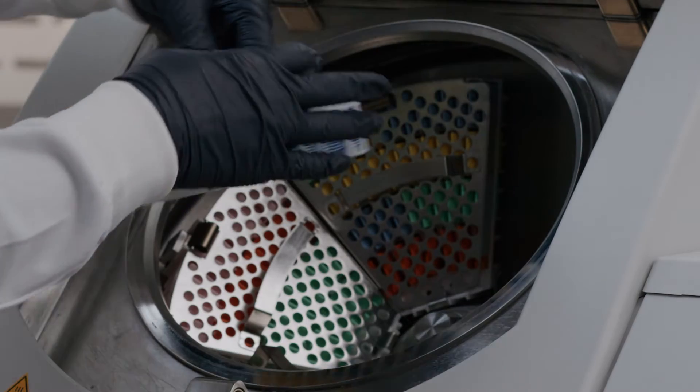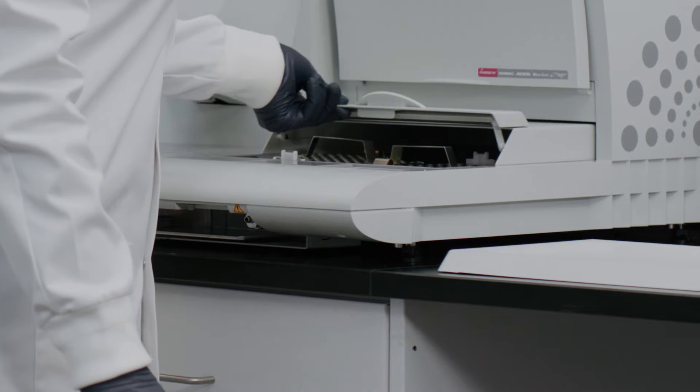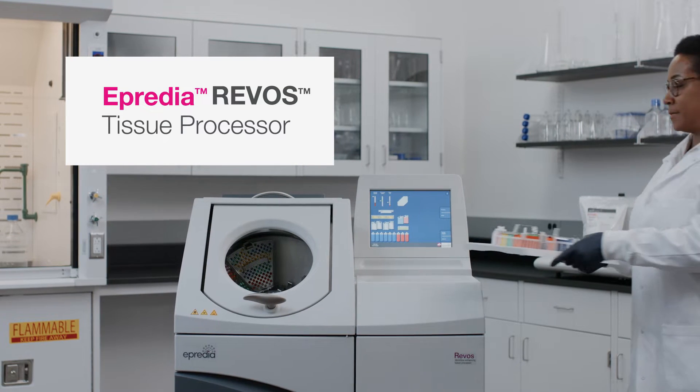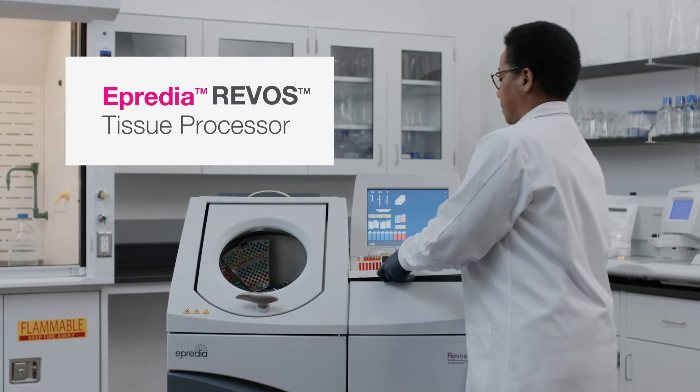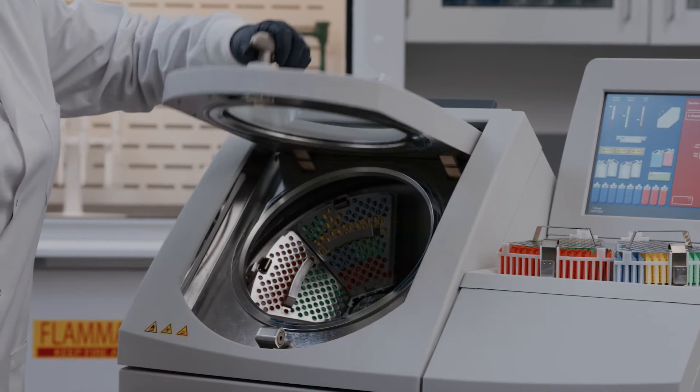Laboratories are being asked to speed up processes, reduce costs, and eliminate errors, but staffing shortages and work volumes are at an all-time high. With the Apredia Revos Tissue Processor, your laboratory can overcome these challenges and have confidence in your tissue processing results.